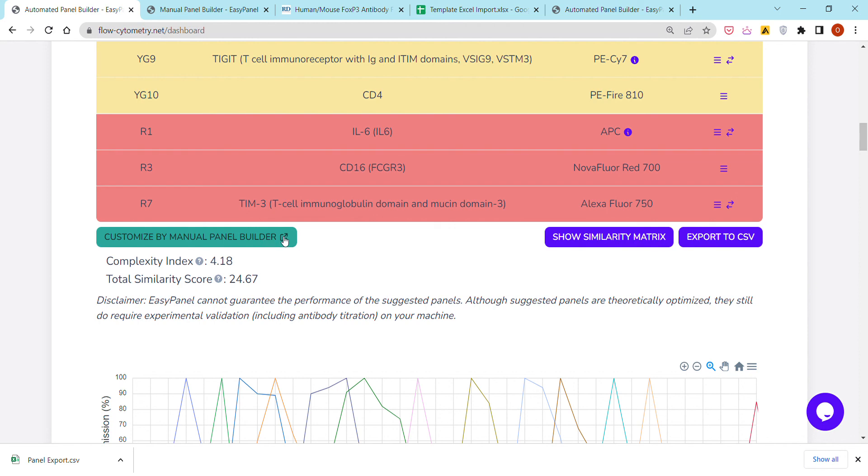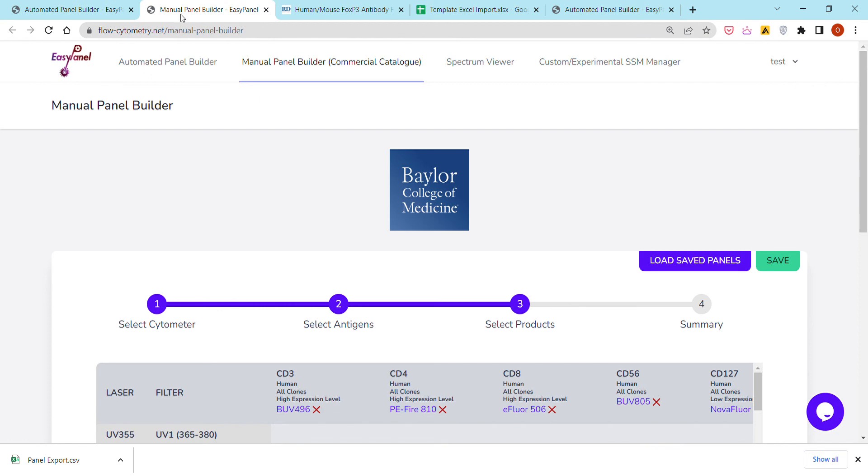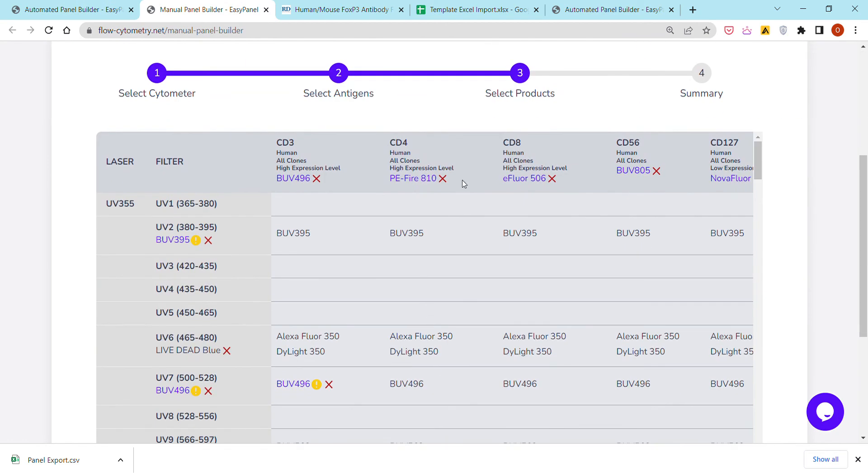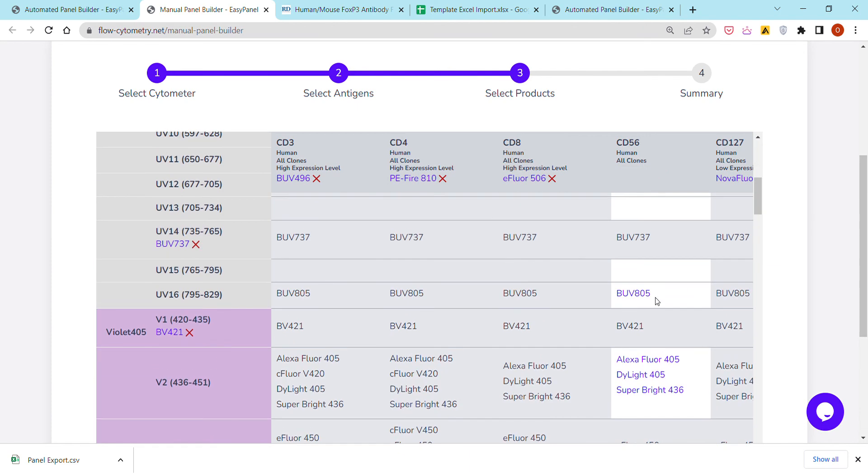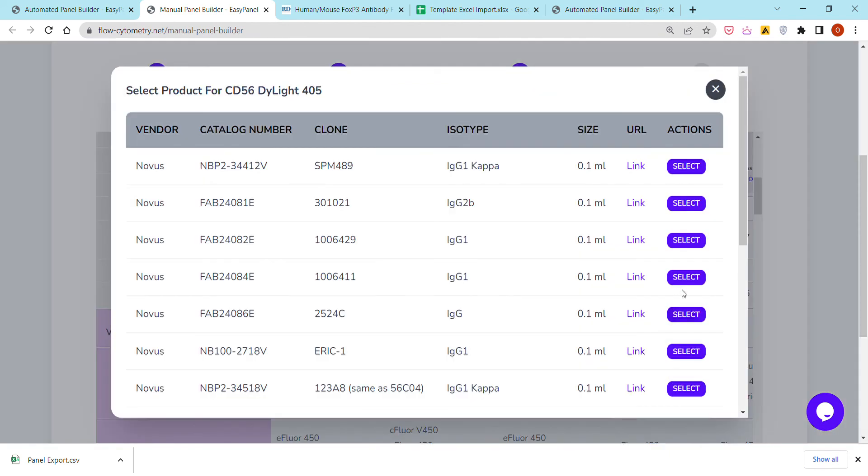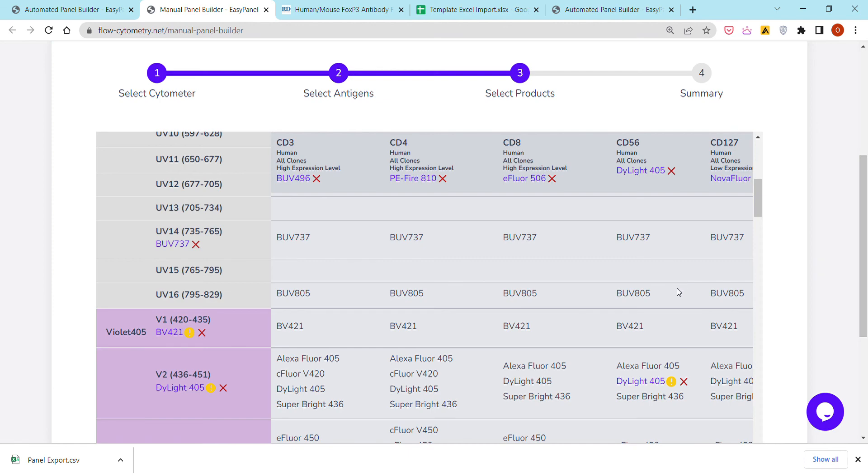Of all the products that exist. For example, if for any reason you do not like the suggestion of CD56 BUV805, you can always remove it and you will see the full commercial database of CD56 human, and so you can make whichever selection you're interested in and then move to the summary page.